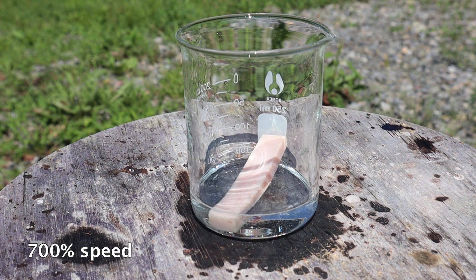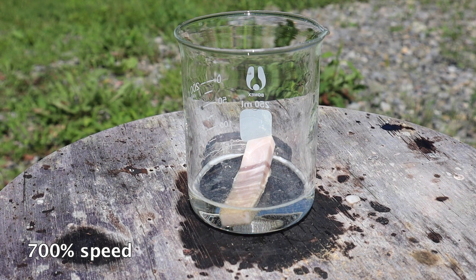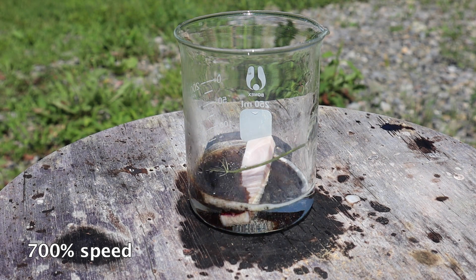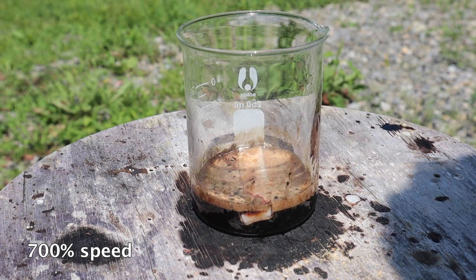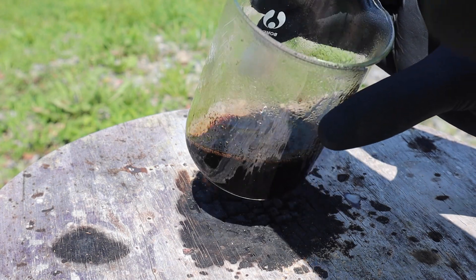I wanted to try a piece of meat, so I put a piece of ham in, because why not? After a few minutes, the meat was completely dissolved.